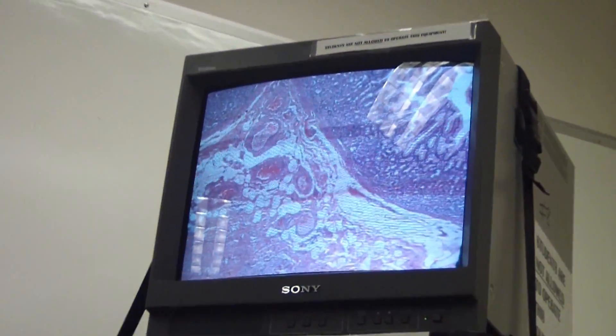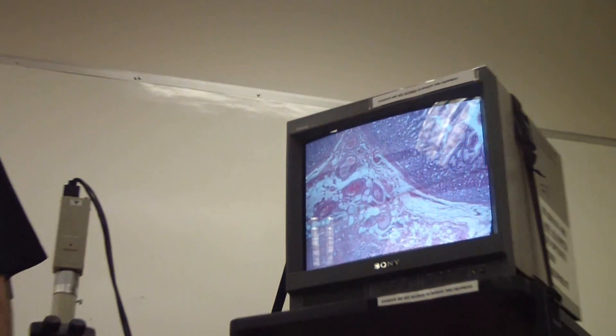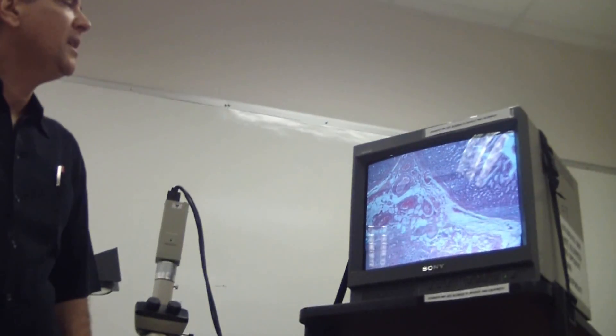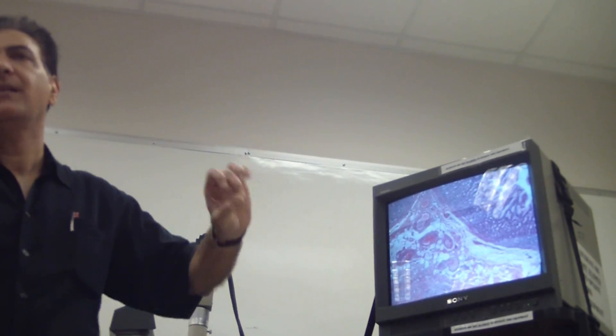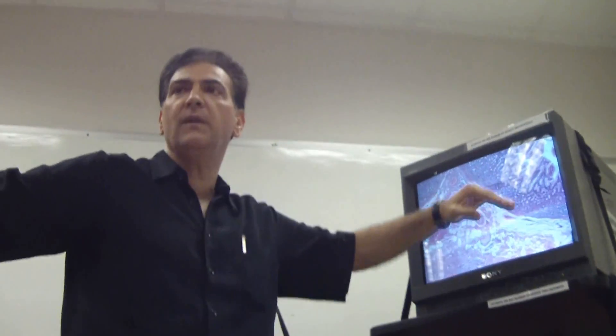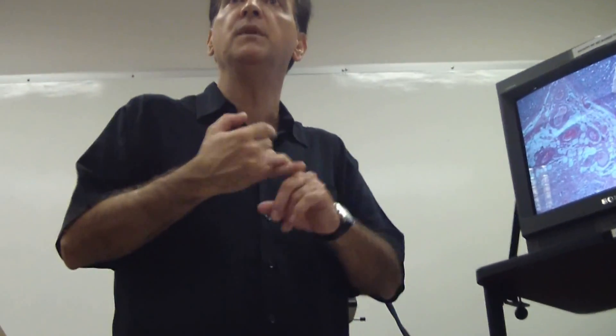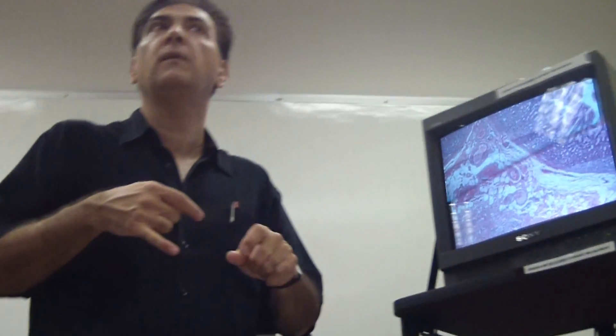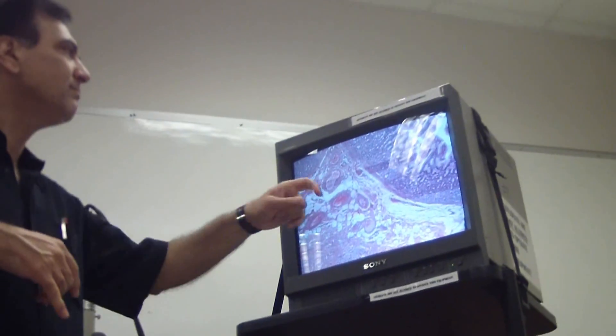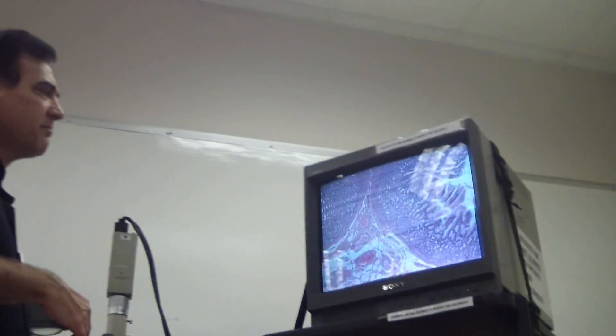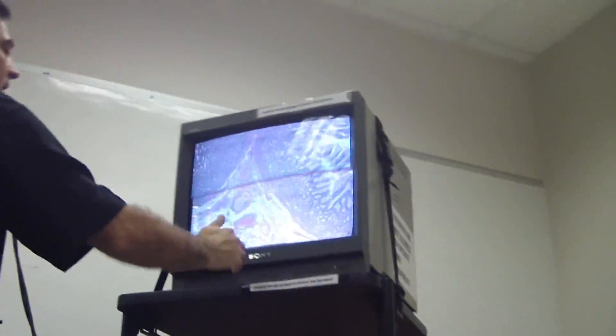Now I think I have in there to identify some of those gastric glands. Do I have to identify the parietal cells, the chief cells? Really, just ignore that guys, because this slide is not really stained. They did not stain those cells. Remember in the mucosa of the stomach we have those gastric glands with four different types of gastric cells: the parietal cells, the chief or zymogenic cells, the mucosa neck cells, and the endocrine cells. But since they did not stain them, just don't worry about that. Just go after the layers: the mucosa, the submucosa, the muscularis externa with a serosa or adventitia.